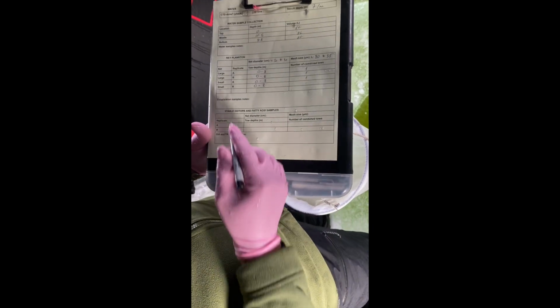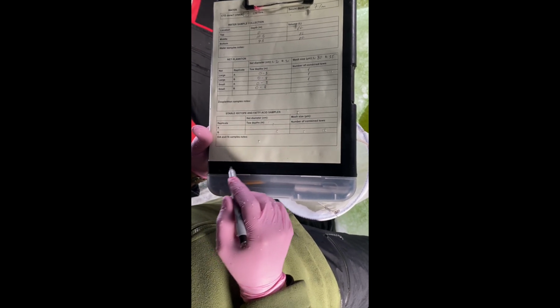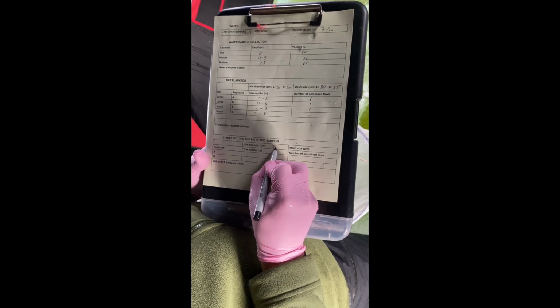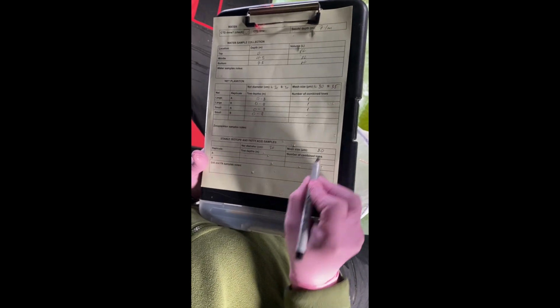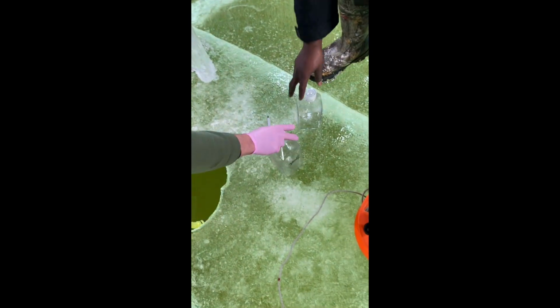So really the last thing that we're going to do is collect duplicate tows for stable isotope and fatty acid analysis in zooplankton. We're going to use our 80 micron mesh for this, and we're going to collect it in duplicate into these larger bottles.